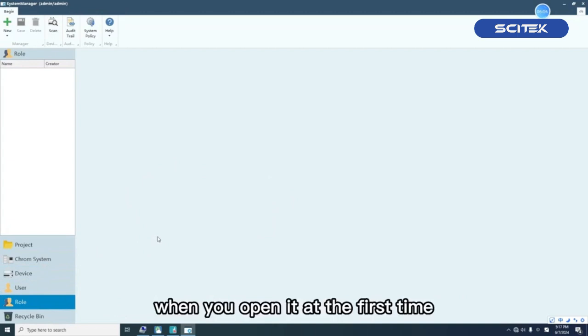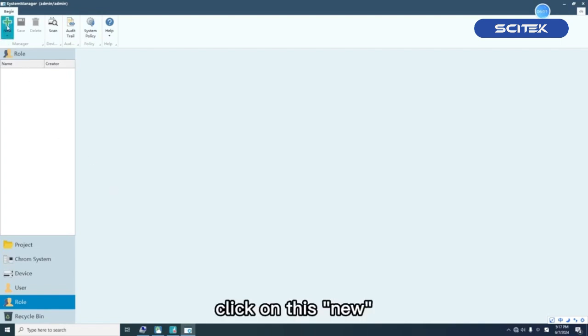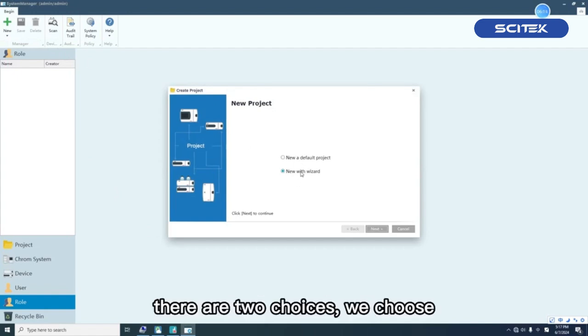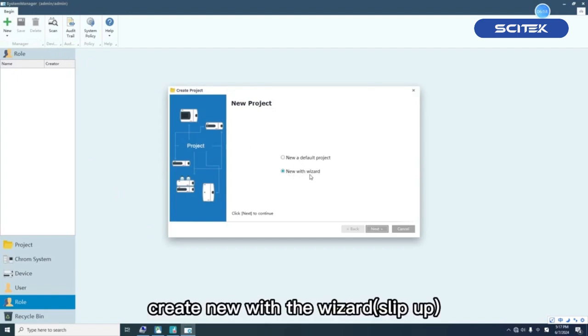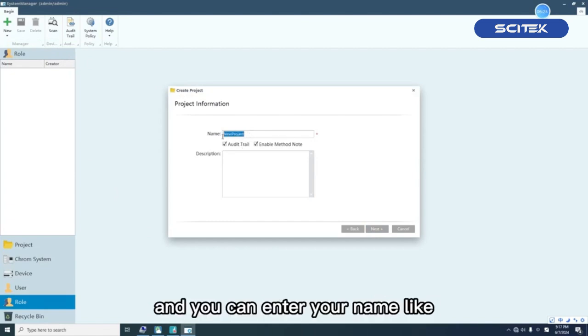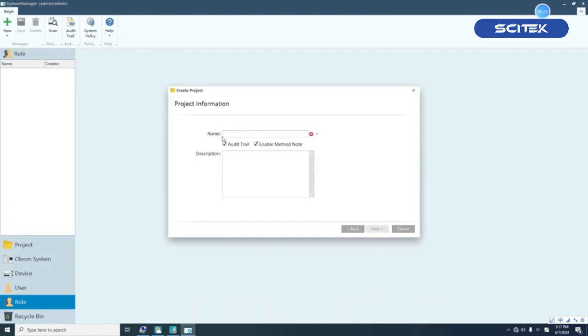When you open it for the first time, you need to create a new project. Click on this new project. There are two choices. We choose create new with the wizard. Next. And you can enter your name, like trainer 01 project.